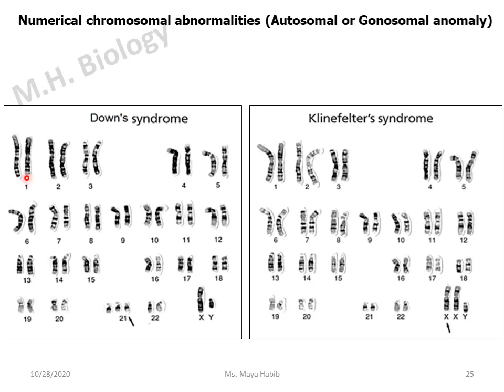So, we should inspect each pair at a time. You can notice that all chromosomes exist in 2 copies except for chromosome number 21, which exists in 3 copies instead of 2 copies. Such type is known as trisomy. Tri means 3, as in 3 copies.